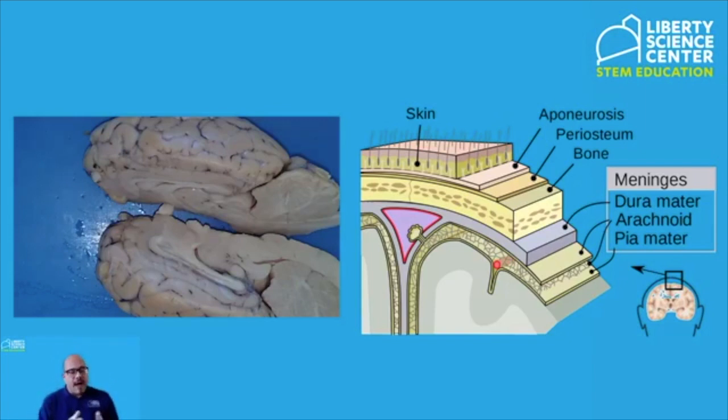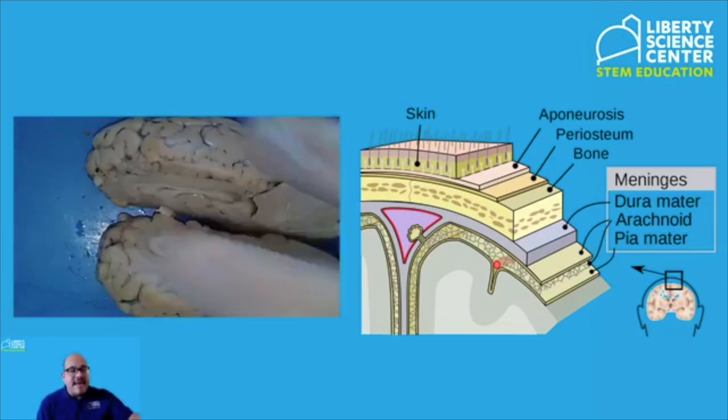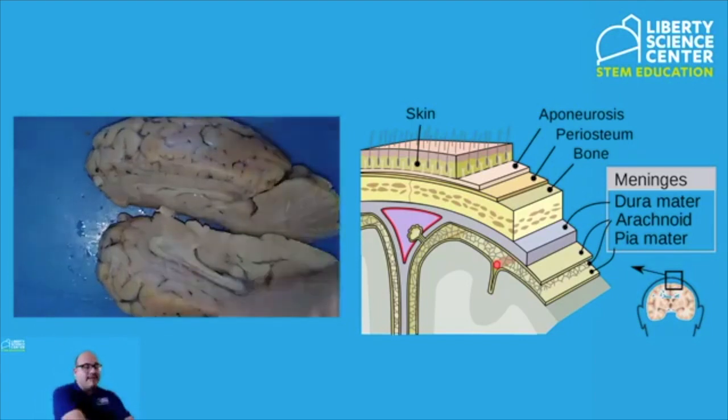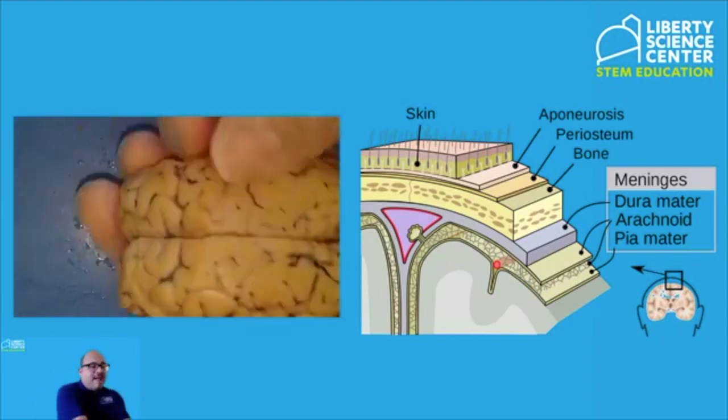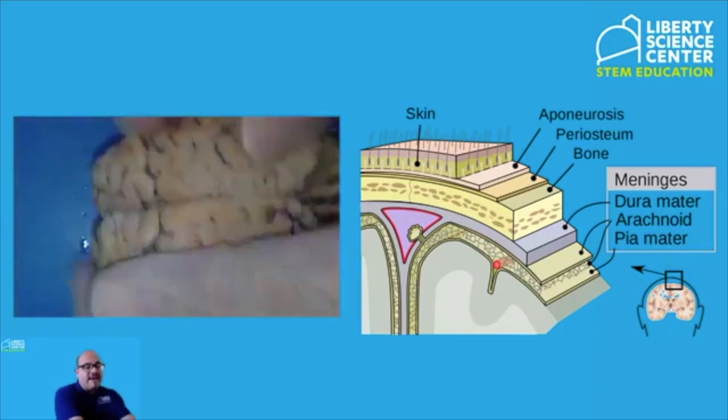These types of specimens do not have the dura or the meninges wrapped around them. If I had my brain here, my hand is like the covering that protects the brain from the outside environment.